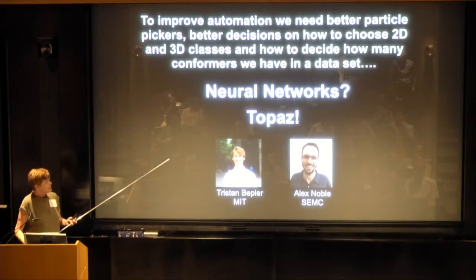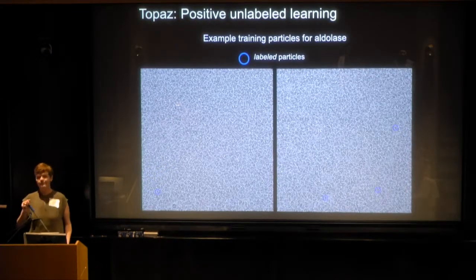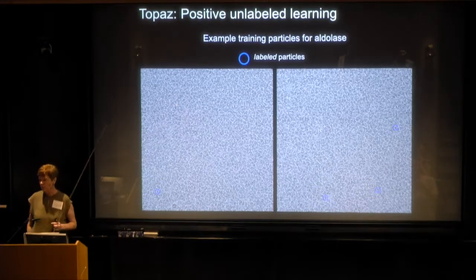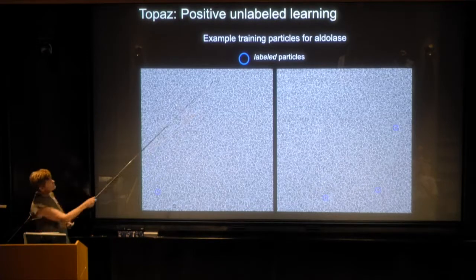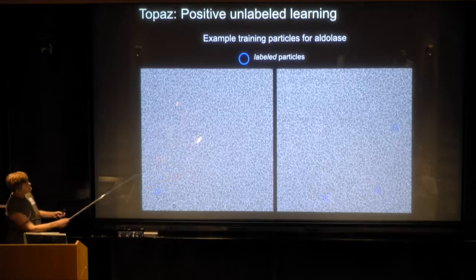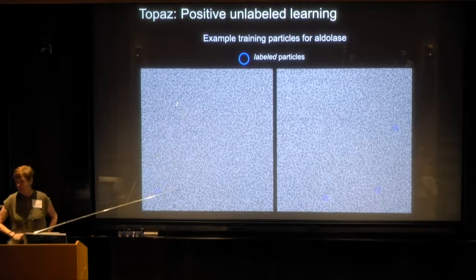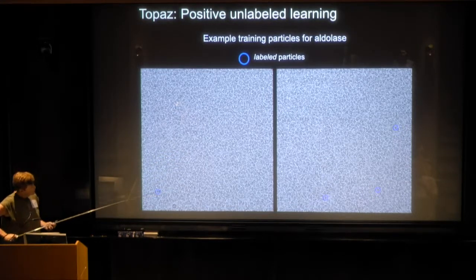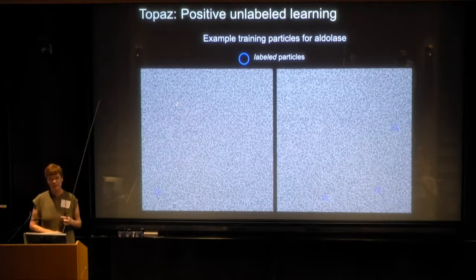And they've put together, for now, just a particle picker. What I love about this particle picker, most neural nets, you have to exhaustively pick all your particles and you have to exhaustively pick your not particles. This, the whole training data set, this is what our images look like. They're super, super, super crowded. And there's one here, and there's another three there, and that's how sparsely they picked this training data set.